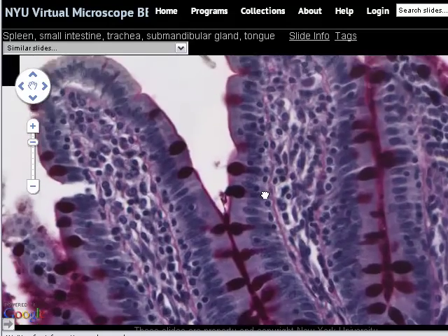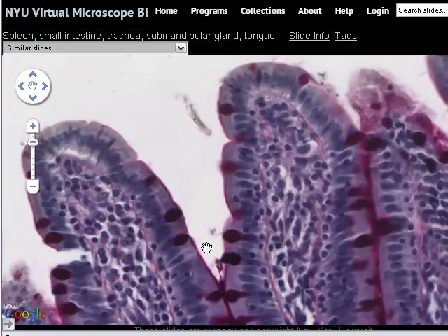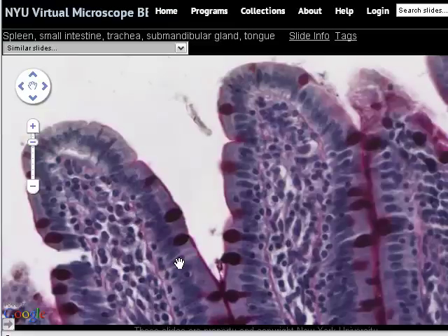As we increase in magnification again, it should be very evident that here's one villus and here's another, both lined by a simple columnar epithelium. Here's one cell — at the basement membrane you see this little thin red line. These cells are taller than they are broad, making them columnar, and it's simple because all of the nuclei line up in a single row, all attached to the basement membrane.